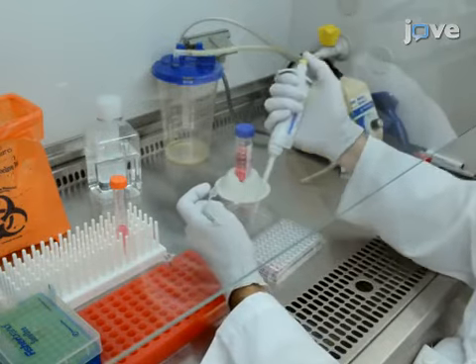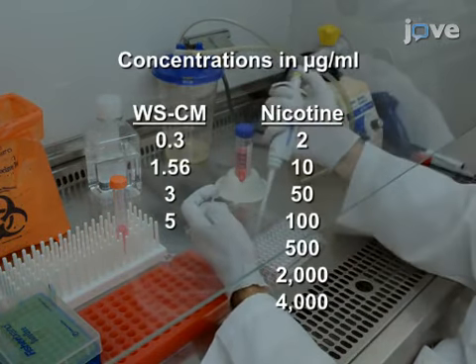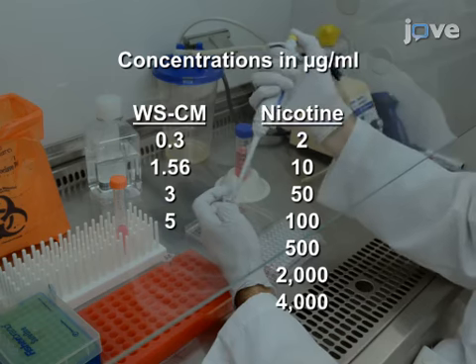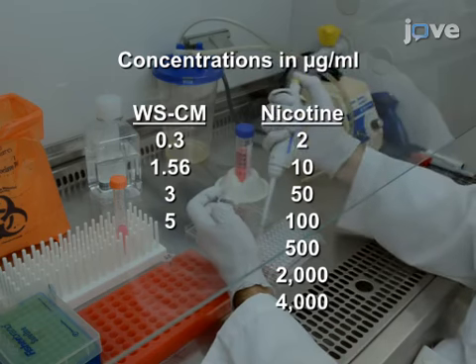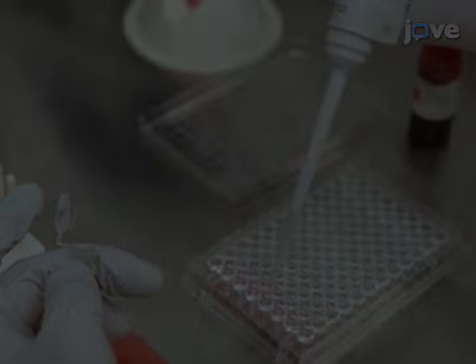Before beginning the staining procedure, dilute whole smoke conditioned medium and nicotine at the listed concentrations in RPMI complete medium to a total volume of 100 microliters per well in a 96 well plate.